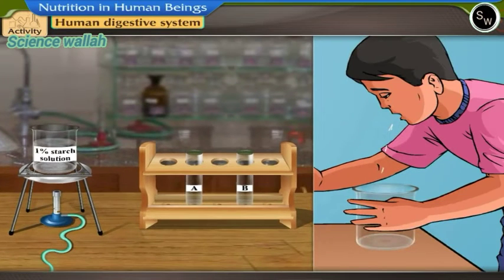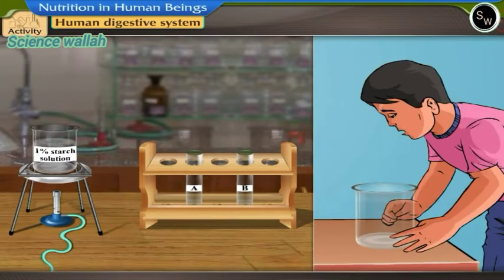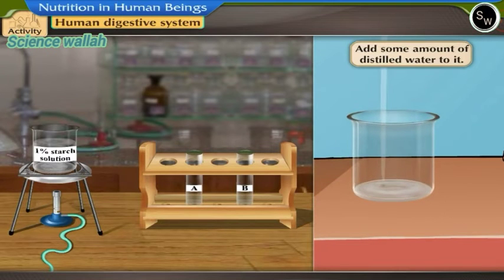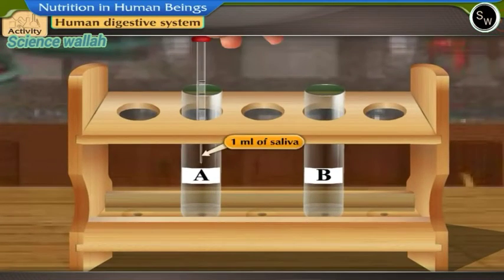Collect saliva from the mouth by spitting into a beaker. Add some amount of distilled water to it. Add 1 ml of saliva to test tube A.